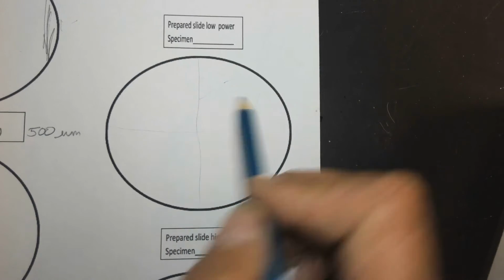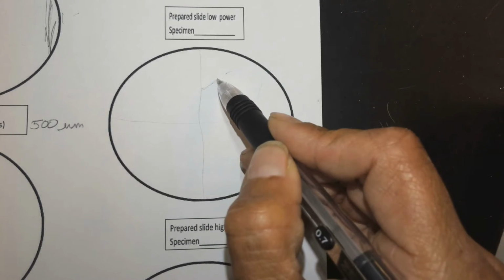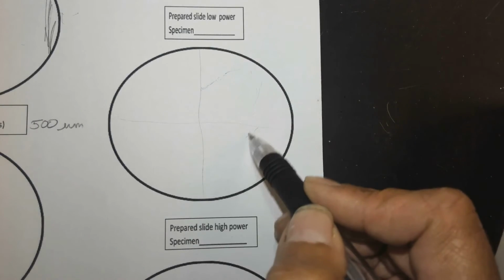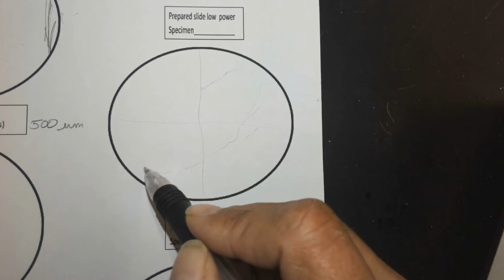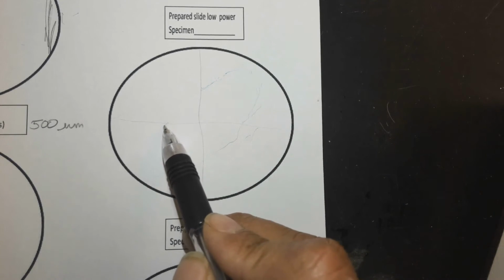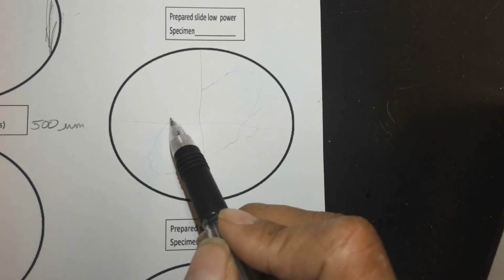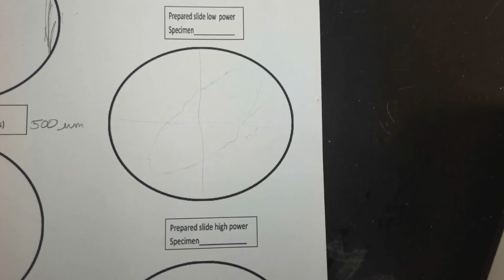You do have two choices. You can draw with the colored pencils, or if you prefer, you can draw with a pencil lightly. Okay. And then this will help you. So I'm just using a rough scale through the eyepiece to show what I'm seeing. Now each microscope is different, so each drawing is going to be slightly different based on how big the field of view is.